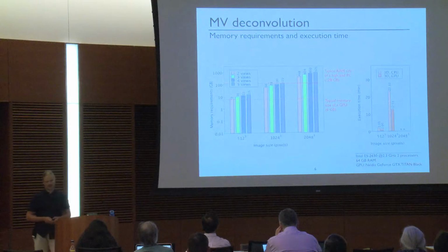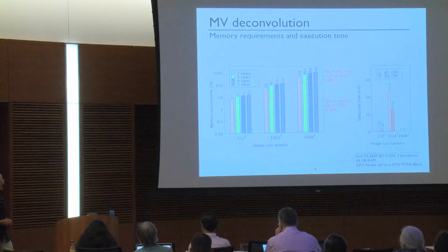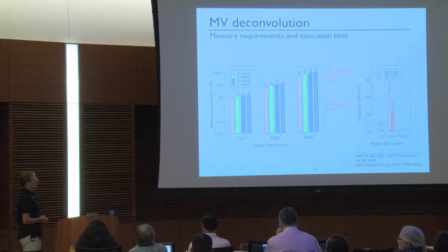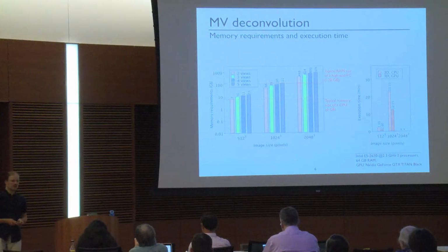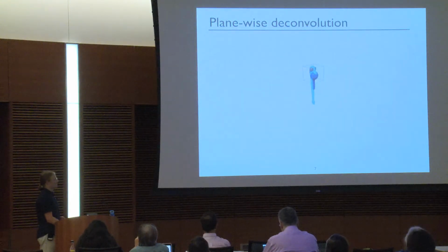But now if we go one step back and think about this, this is 3D deconvolution, and do we really need that? We don't really need to deconvolve to improve the XY resolution. Our goal is primarily to improve the Z resolution, and that leads me to the basic idea of my work here. This is to do the deconvolution not in 3D but in 2D, namely in the plane which contains all the bad Z resolutions. This is nicely shown in this little animation here.